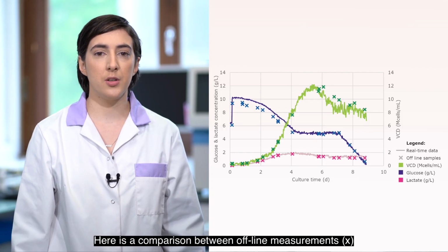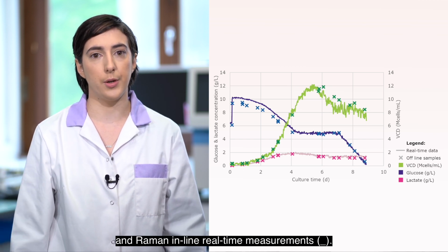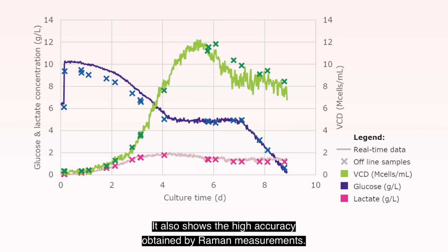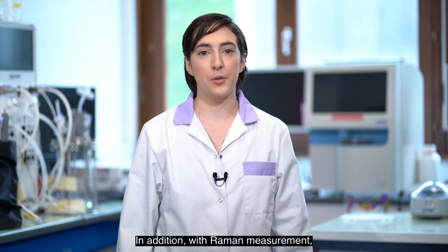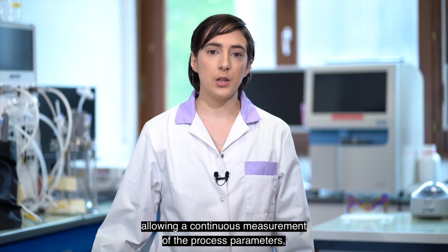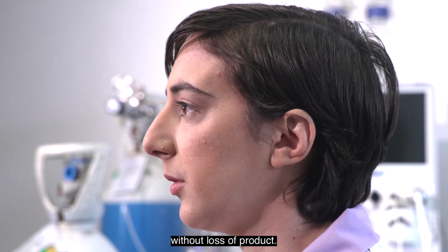Here is a comparison between offline measurement and Raman inline and real-time monitoring. It shows the increase in data points between Raman measurements compared to offline sampling. It also shows the high accuracy obtained with Raman measurement. In addition, with Raman measurement, there is no need for human interaction nor loss of volumes, allowing continuous measurements of the process parameters without loss of product.